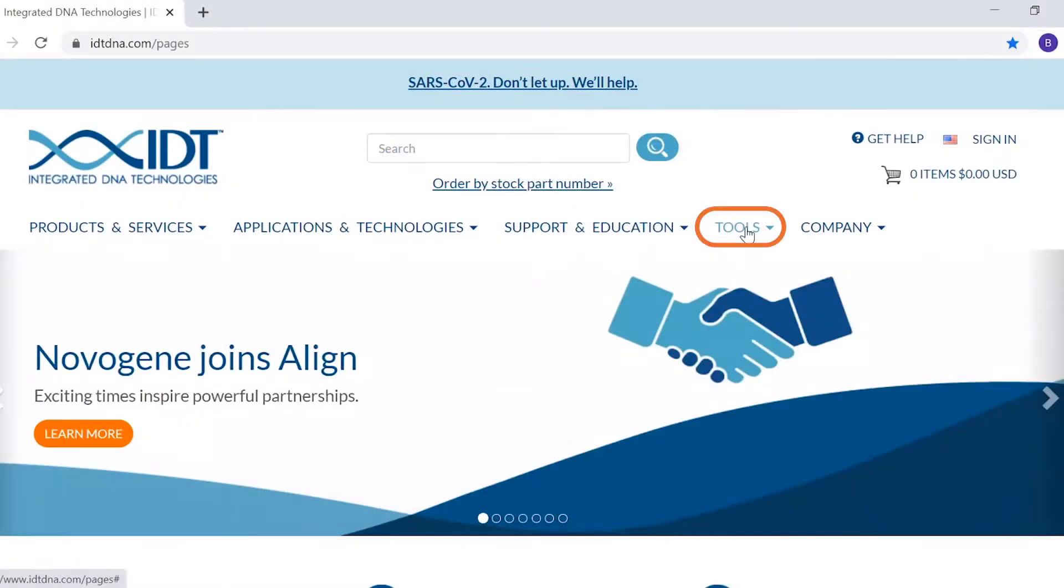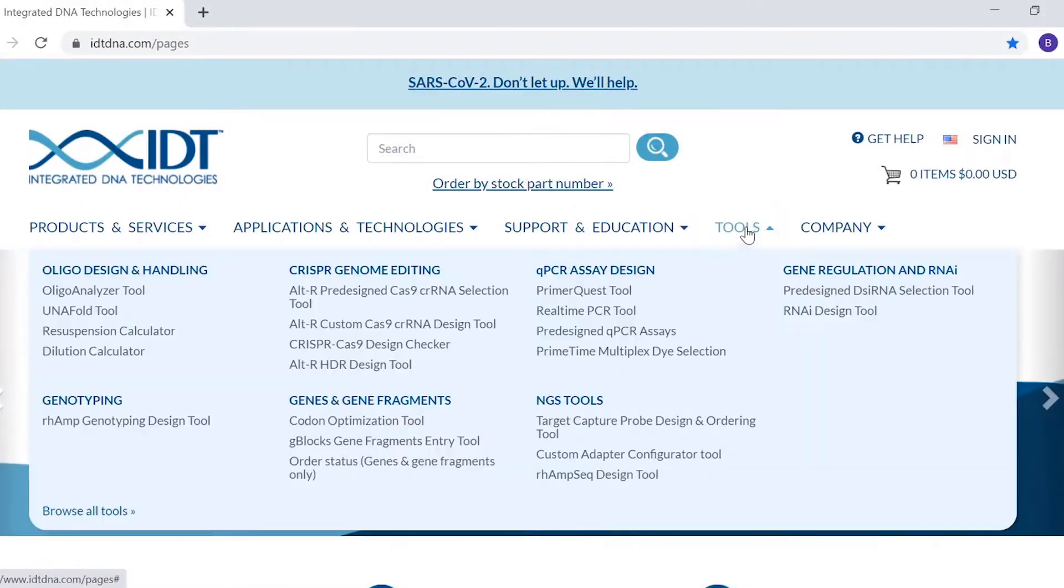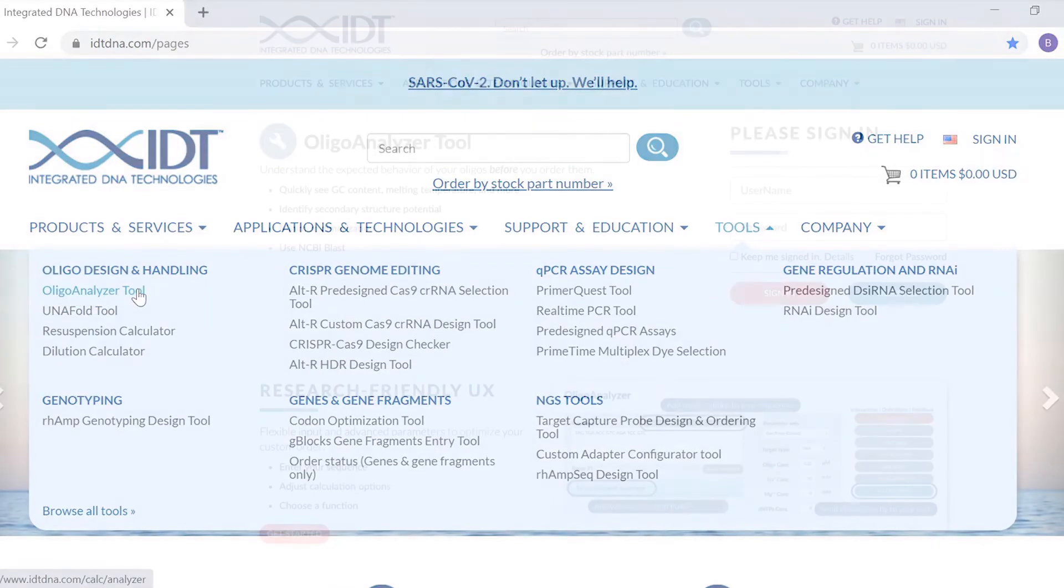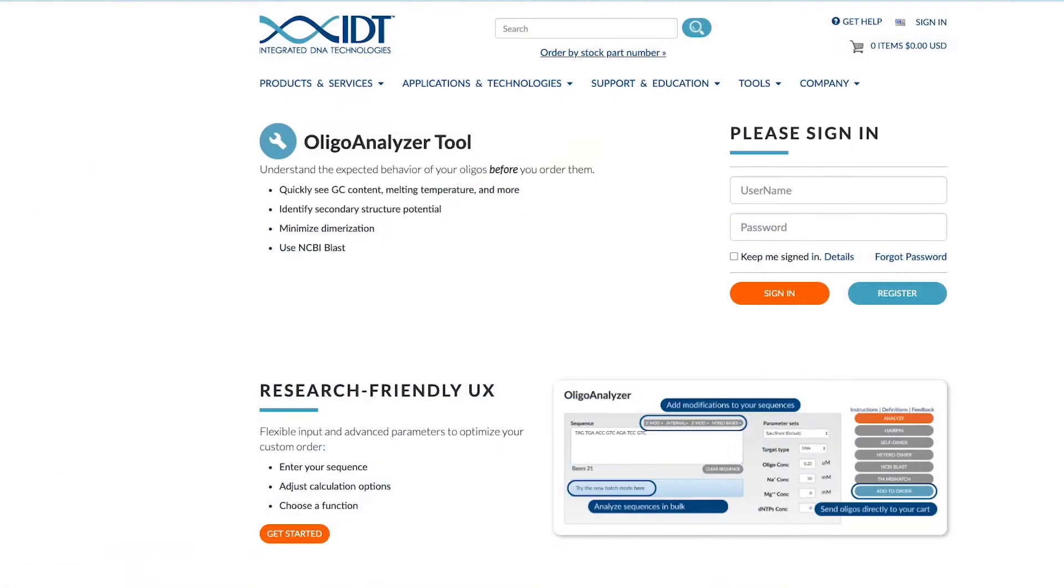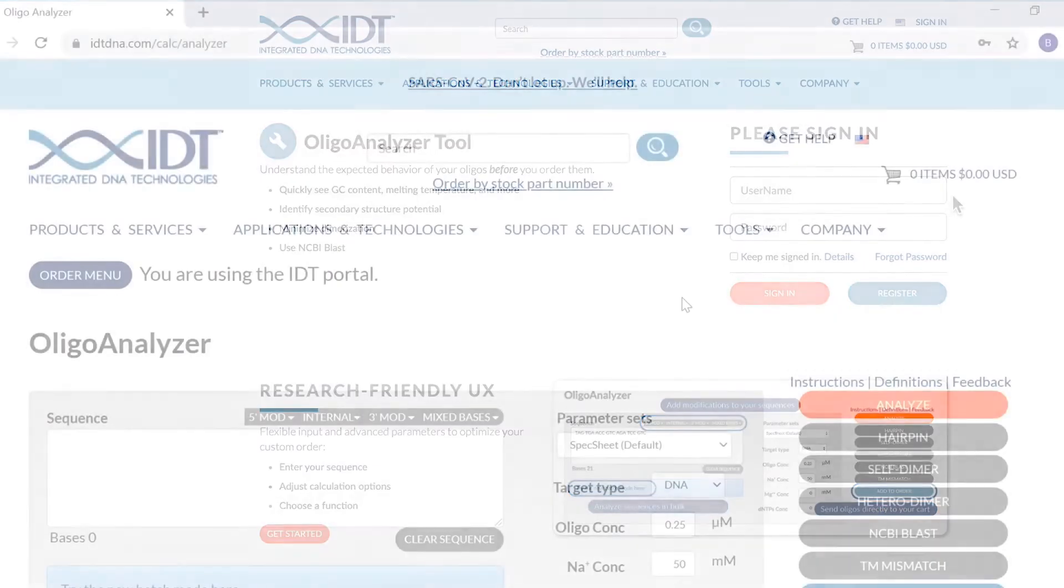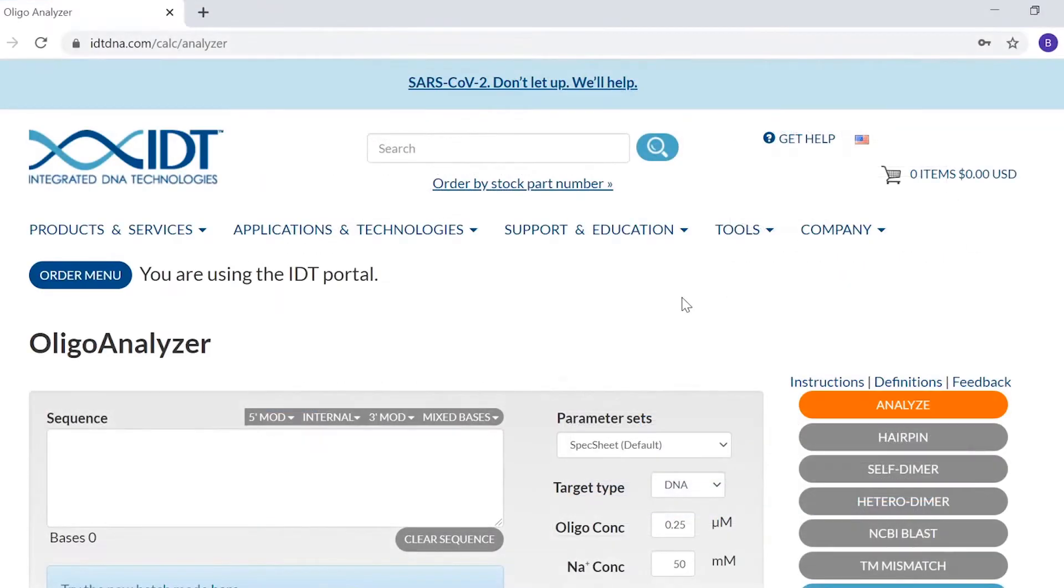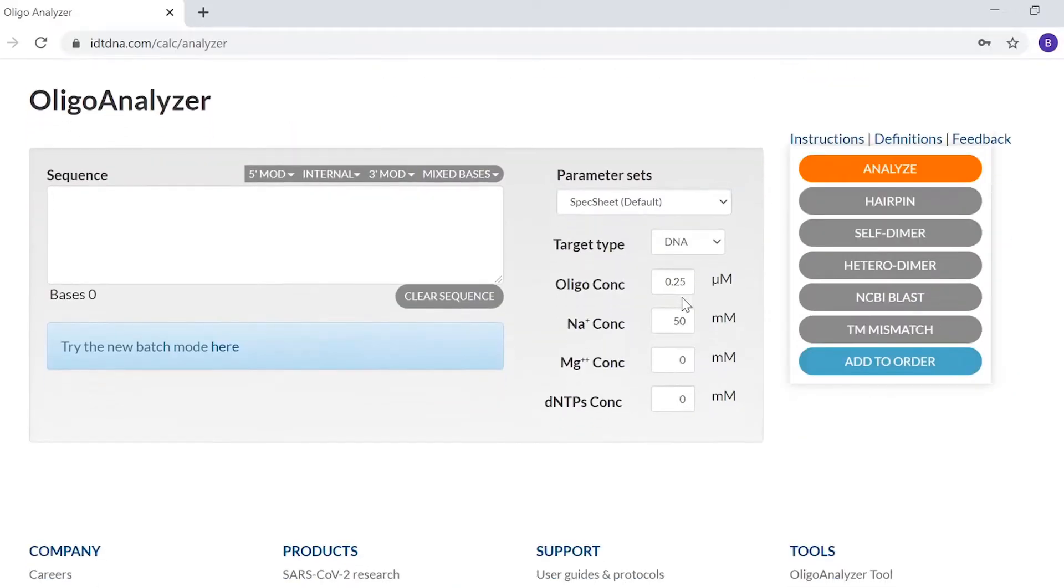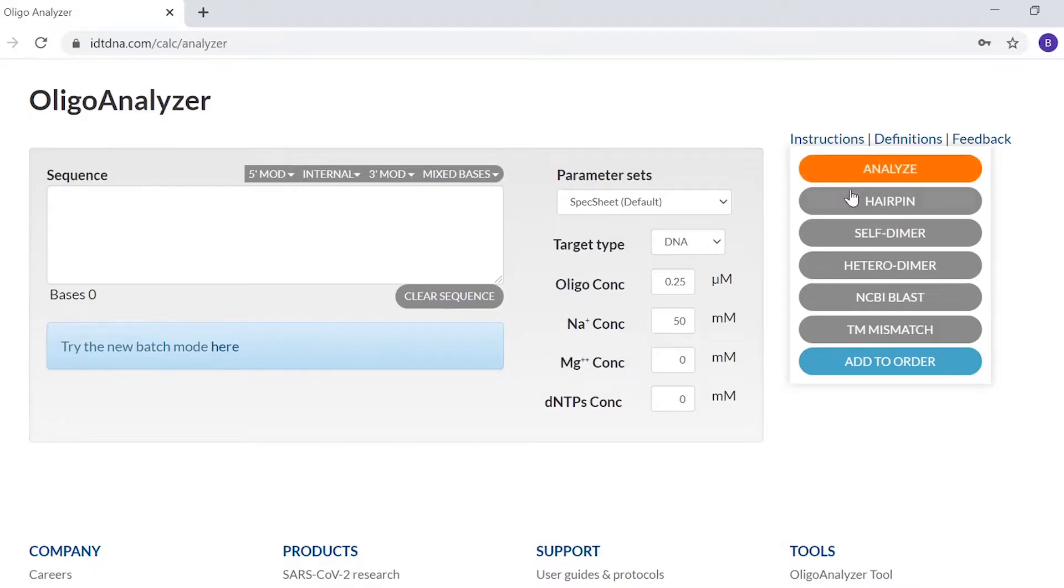Find the Oligoanalyzer tool in the Tools drop-down menu on the IDT homepage, under Oligo Design and Handling. Log in using your IDT username and password. So you can get the most valuable information from the Oligoanalyzer tool, we'll show you its most popular functions. You can see these in the button list on the right-hand side of the page.